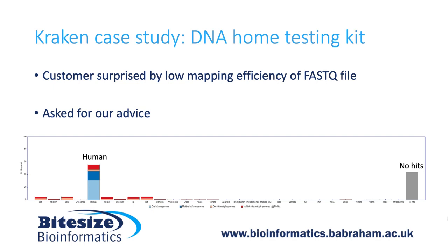So I wanted to talk about a case study using Kraken that we had, and how it's used for contamination detection. We received an email some time ago from somebody who had been using one of these test at home DNA kits. The idea is you provide a sample of your own DNA, you then send it off, and the company will give you information based on the sample that you send.